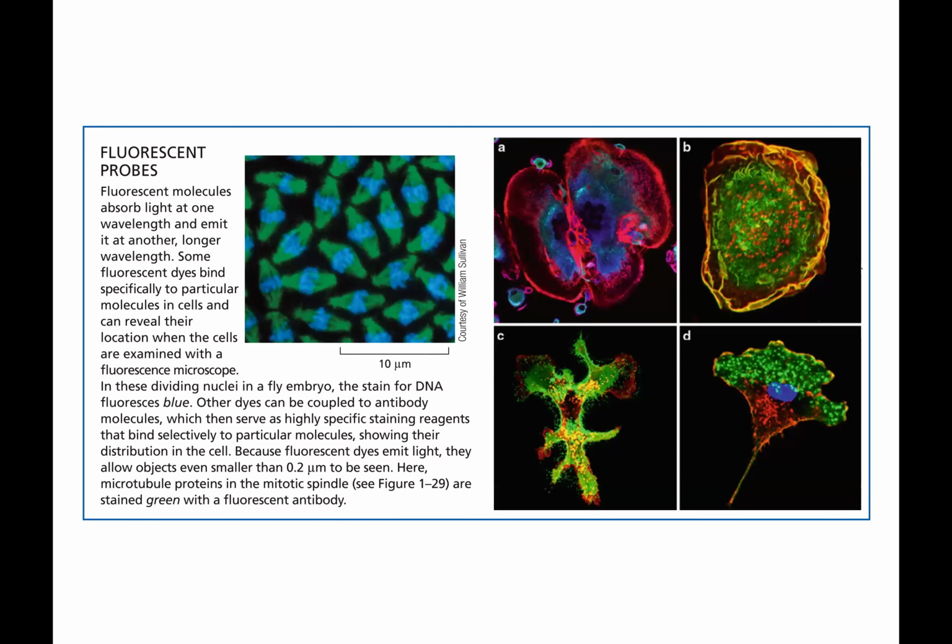Fluorescent microscopy is always going to have a black background and bright colors.